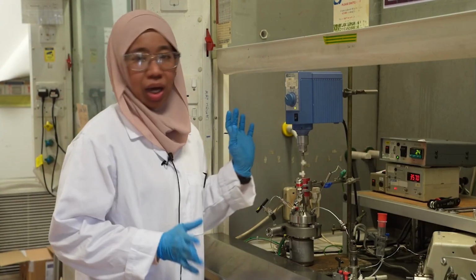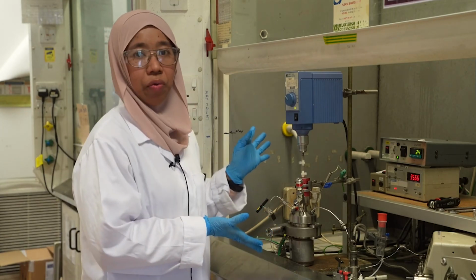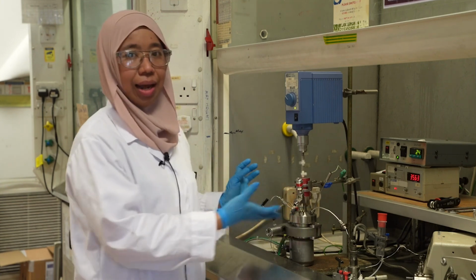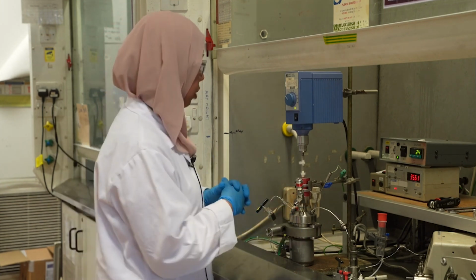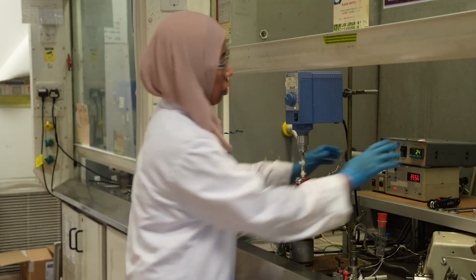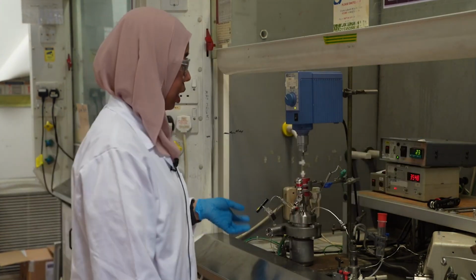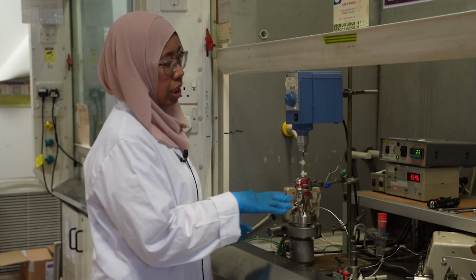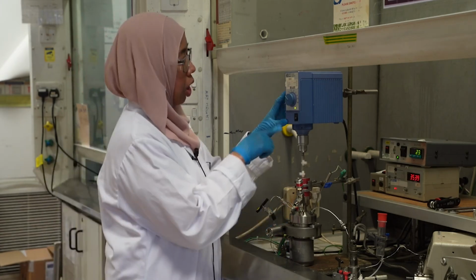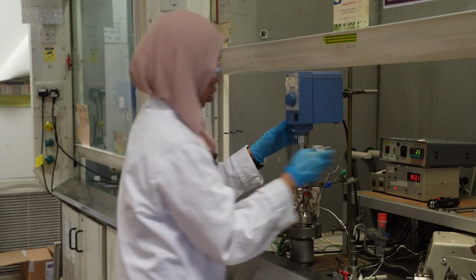So I pretend that the reaction has completed. This is how I'm going to show you how we stop the reaction and detach everything and collect the final product. First of all, you have to cool down the system to room temperature. So we set the temperature to 0, so it's about 23 degrees Celsius now. After it reached room temperature, we can depressurize the system now. We have to stop the stirrer, okay, and then detach it.